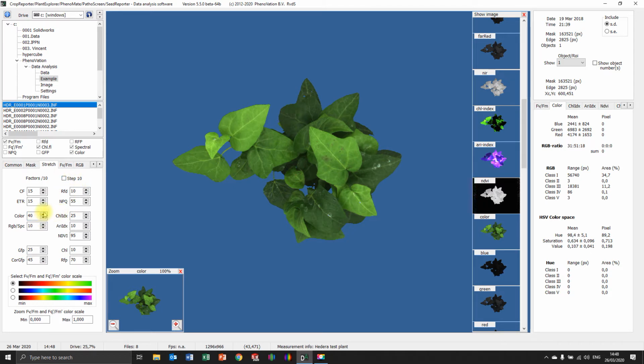We can also increase it by 1 to find the absolute maximum, but you already see at 44... Yeah, like 41 should be the perfect one, 40 would be okay. But this will give you more insight visually. It won't affect the data, but especially if you want to visualize a little bit more.